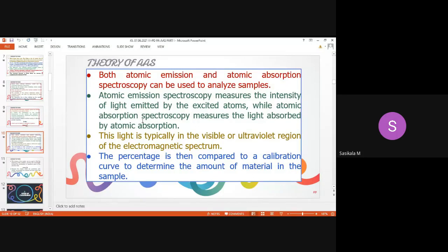Both methods can be applied here. For atomic absorption we will not have the 1% 1 centimeter method like molecular absorption in UV visible spectroscopy. Here, when a reference standard is available, we perform quantitative analysis with the reference standard, using direct comparison and the calibration curve method.